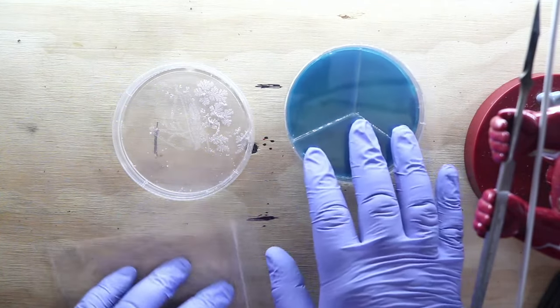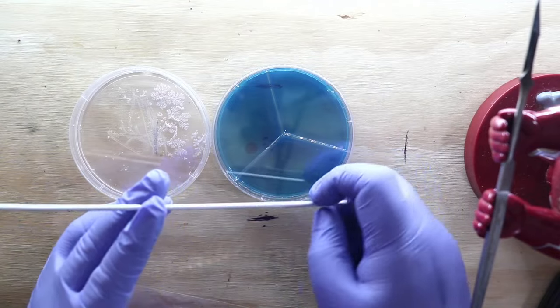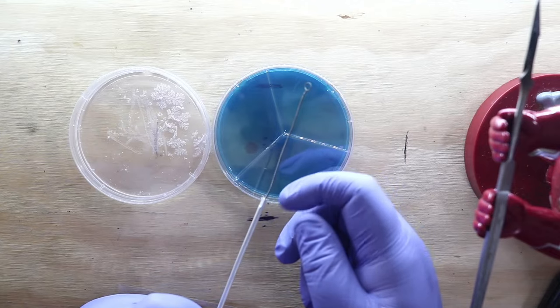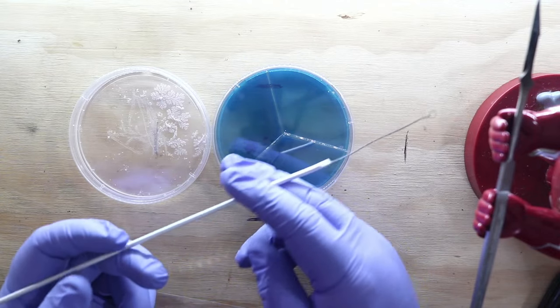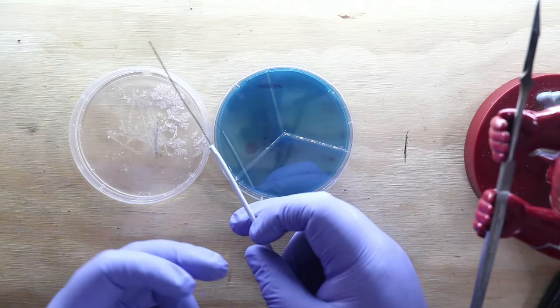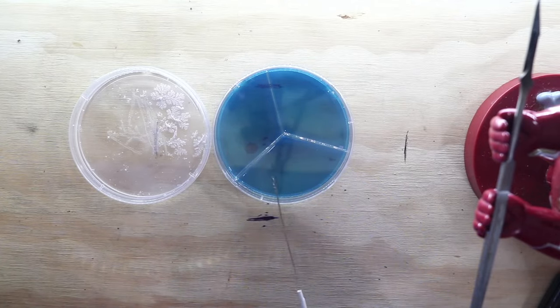We're going to do a spore streak real quick. So those of you guys interested in mushroom breeding, kind of perk up. This is what's called an inoculation loop. I have a fancy one. Whenever I first started, I literally just took a piece of wood and a wire and bent the wire in a circle and then burned it into the shaft, and that was my inoculation loop for years. I've now purchased one, which is titanium and nichrome, I think, and it has lasted a lot longer, but you really don't need the fancy tools. You can just make your own tools a lot of times, but it's very simple.